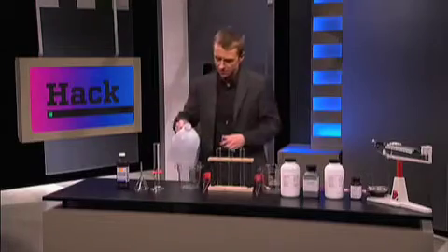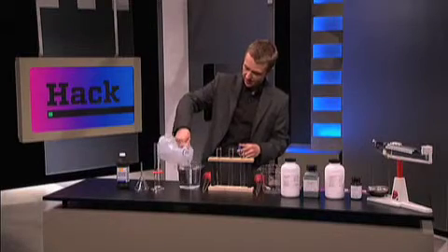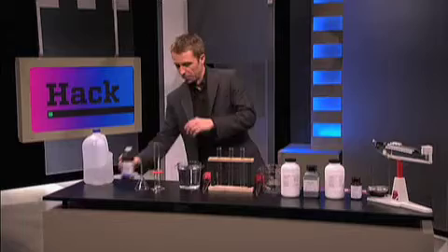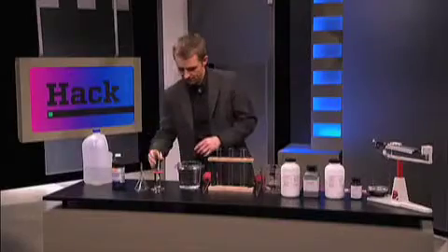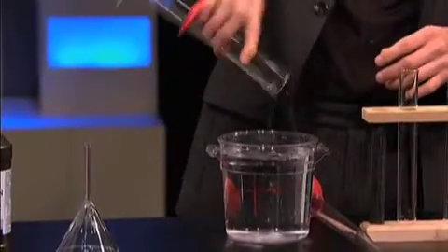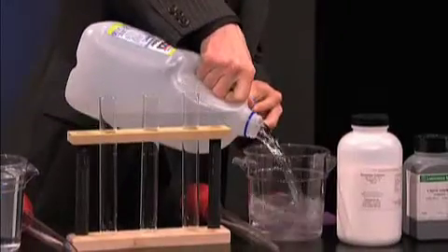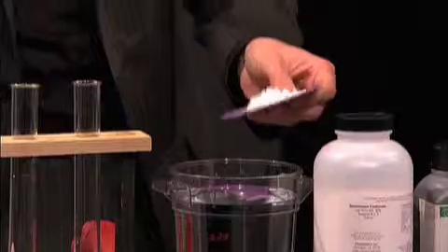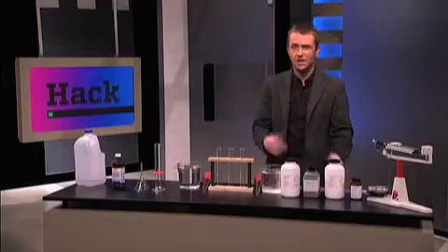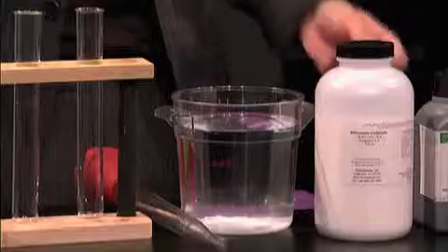All right, so first step, you're going to want to take half the water, a liter, denoted by the 1 and the L. Then you're going to want to pour in the hydrogen peroxide so you can dilute it. Now, in the other bowl, we're going to dump the rest of the water. And the 4 grams of sodium carbonate, which helps all the other chemicals mix well together. Now we're going to put in the 0.4 grams of copper sulfate pentahydrate.